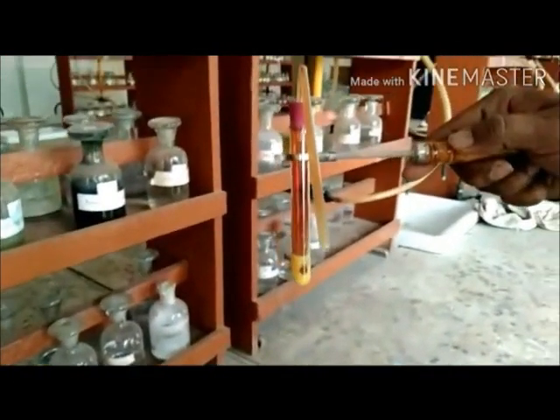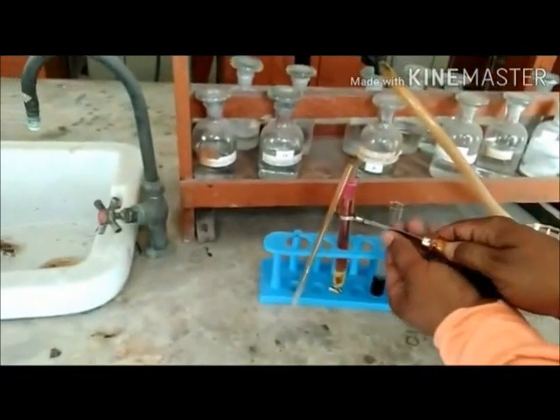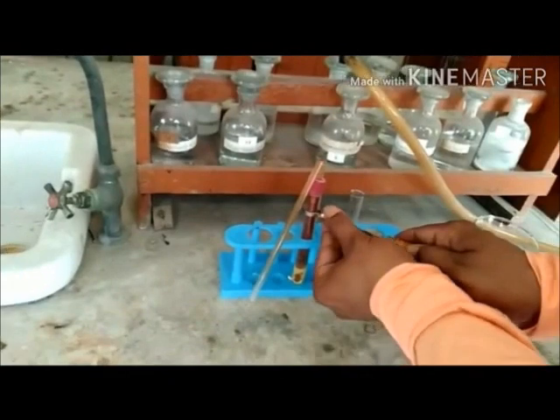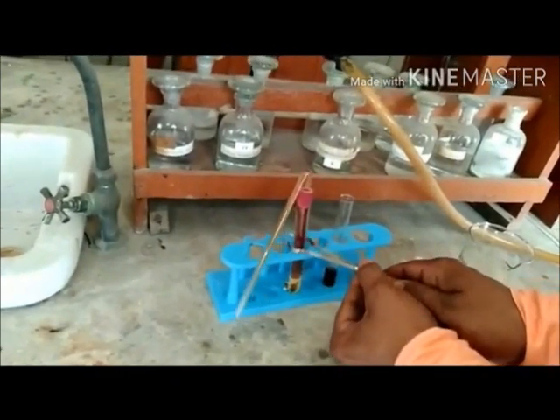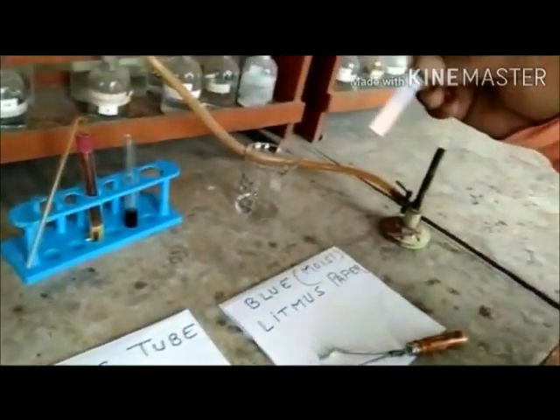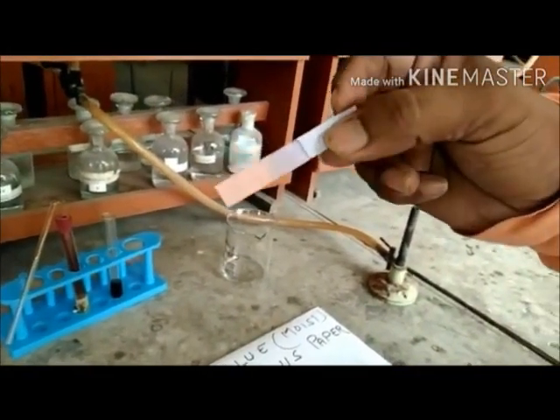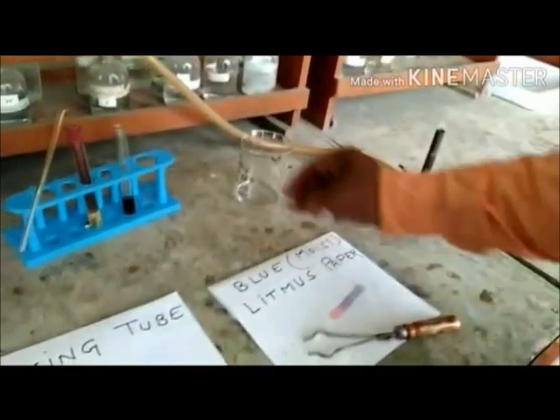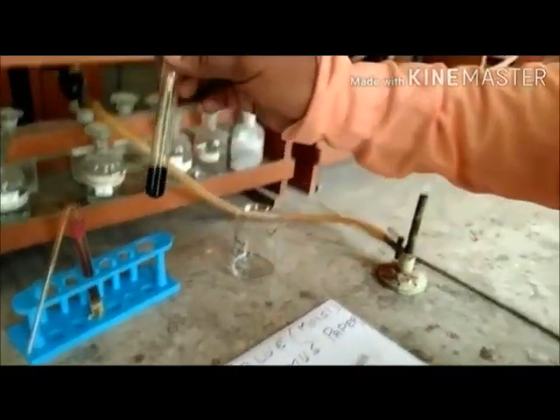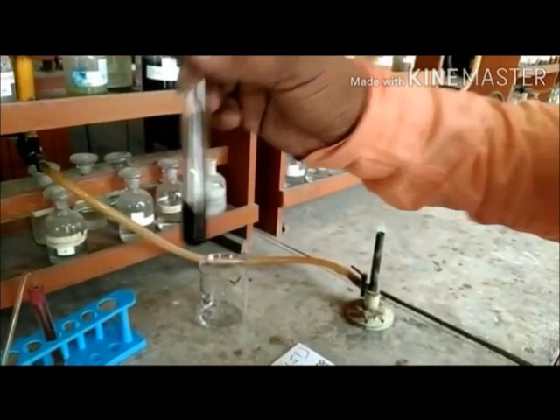However, the residue in the first test tube is reddish brown when hot, and on cooling it changes to yellow and partly fuses with the glass, giving it yellow stains, as you can observe. The litmus paper has also turned red when the gas was passed onto it, indicating that the gas was acidic in nature. The ferrous sulphate solution turned brown-black, indicating the evolution of nitrogen dioxide.